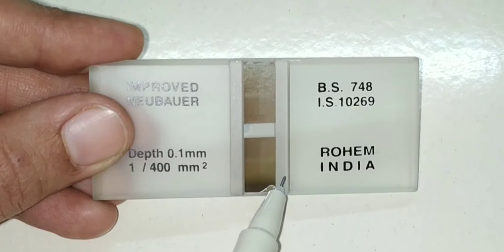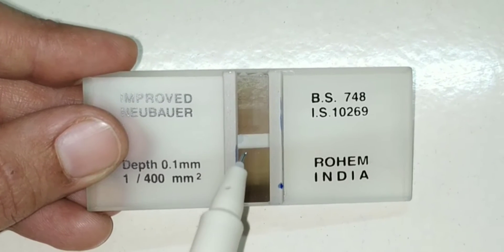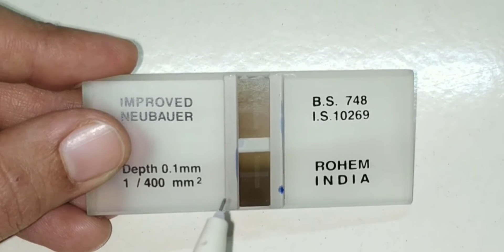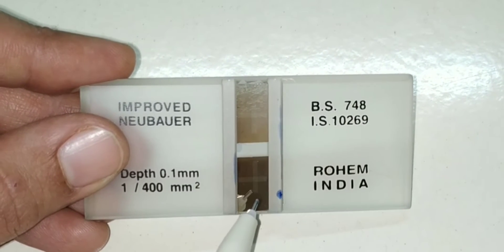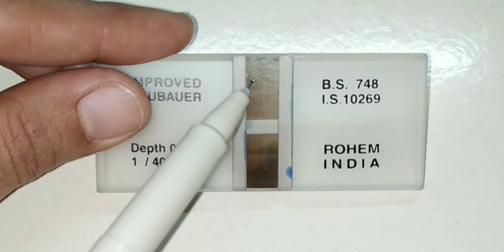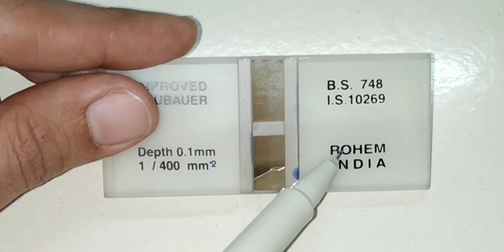These grooves are in the shape of an H, extending right across the middle. The grooves enclose two small rectangular platforms. The central platform, also known as the floor piece, is wider and 0.1 mm lower than the two lateral platforms.